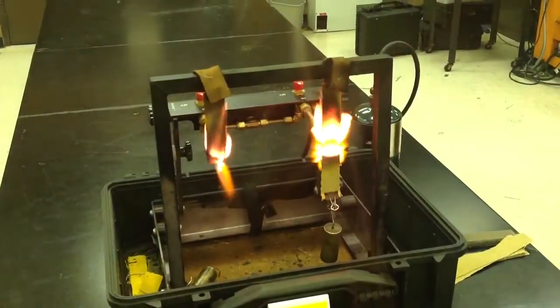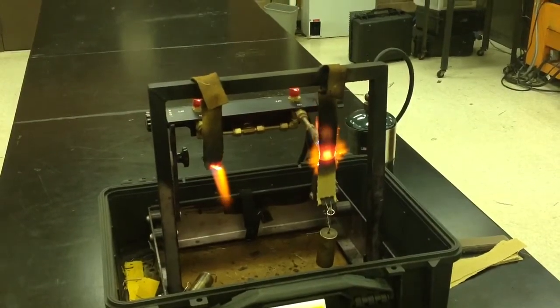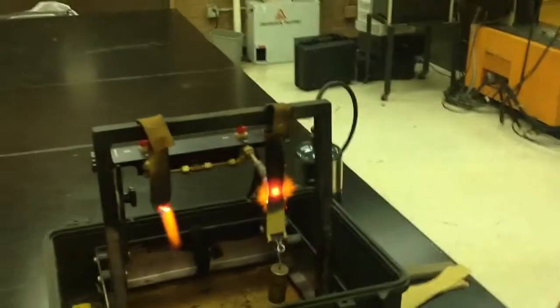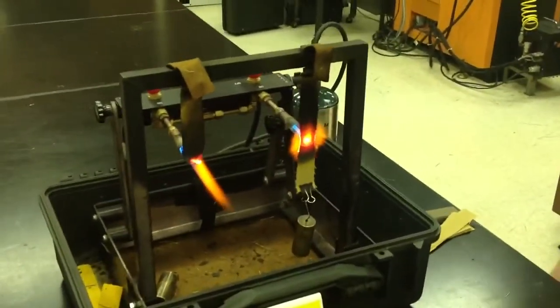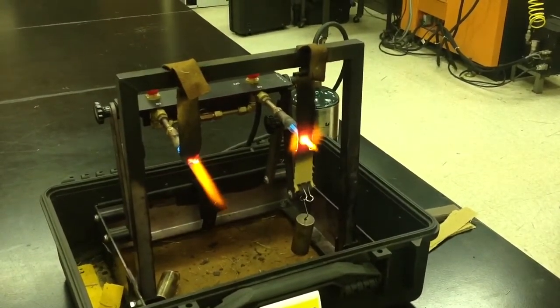The fabric with 40% meta-aramid very quickly burned through and failed. That would simulate a break-open in a flashover scenario, breaking open your first line of defense against a flame — which is the outer shell.